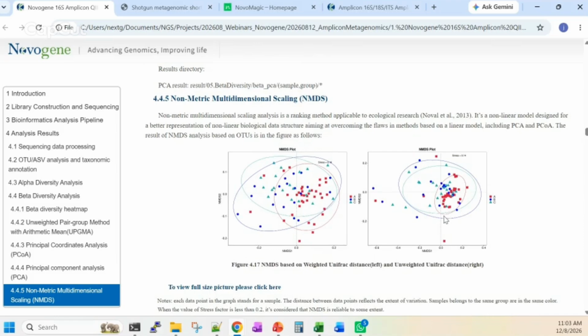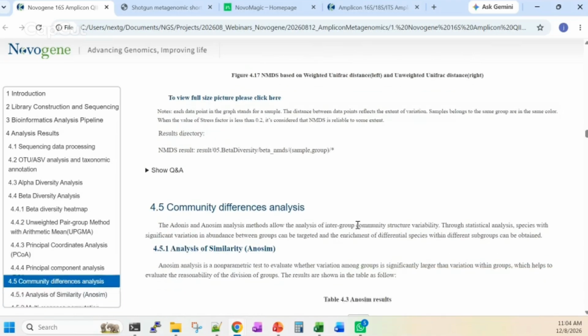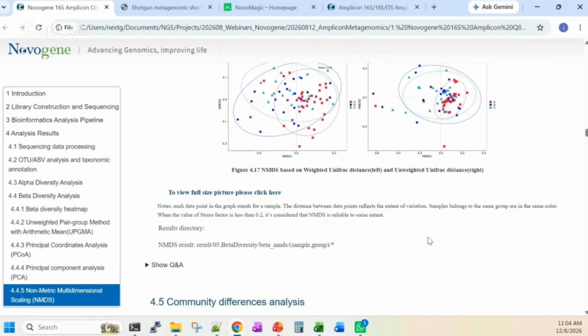So for NMDS, this is a similar approach compared to the PCoA. We'll consider the relationship across different taxonomic units. And again, we can see whether certain sample groups are forming clusters and are different from other sample groups. This one again shows that the sample dots are all distributed across the whole plot, and there is no distinct separation of different dots. So it seems to me overall, based on their microbial profiles, they are actually not that much different. So this is a quick overview when we put all the samples into the plots.